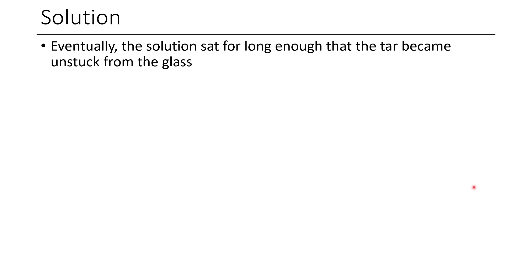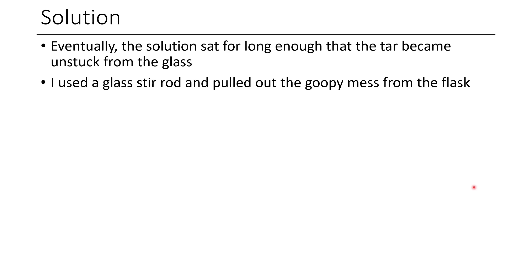And eventually the tar went from like a solid, barely at all moving tar to kind of more like toothpaste, but still tar. And so eventually what happened is I was able to just get a kim wipe on the end of a glass stir rod that kind of stuck the tar onto the kim wipe. And then I was able to pull it through the mouth of the flask, a couple of wipes down with some more kim wipes and the whole flask was clean.